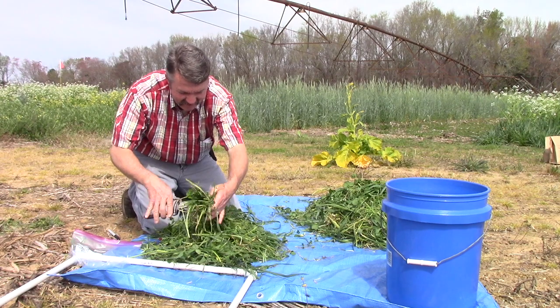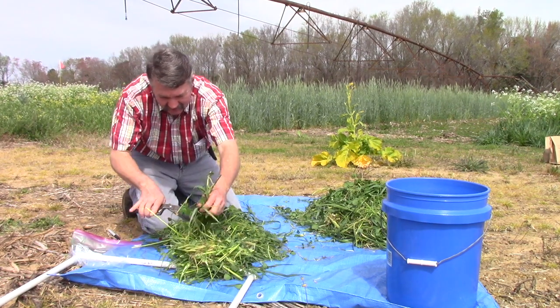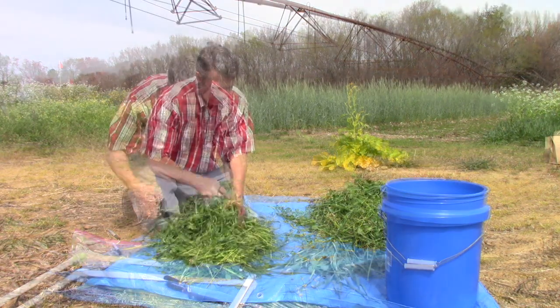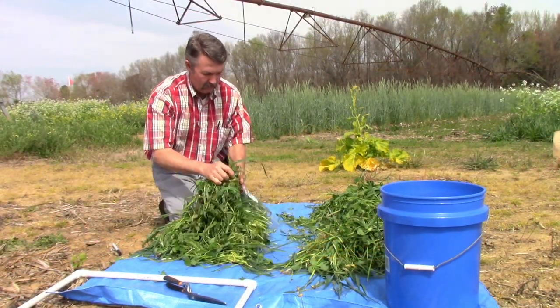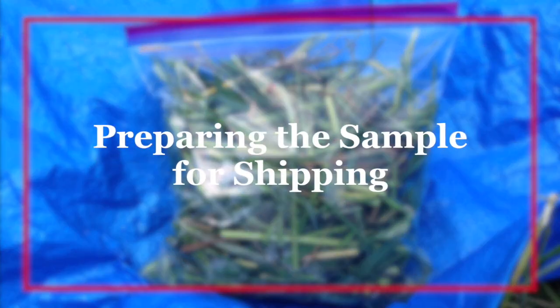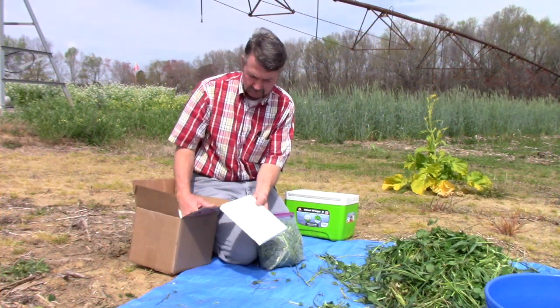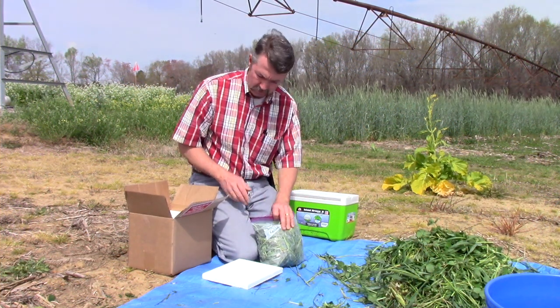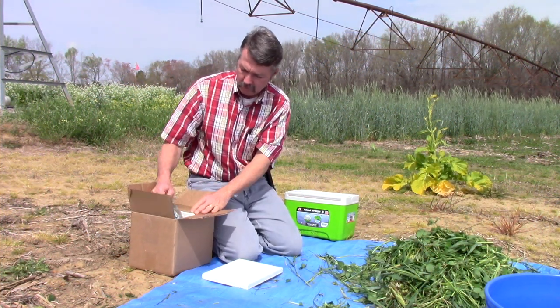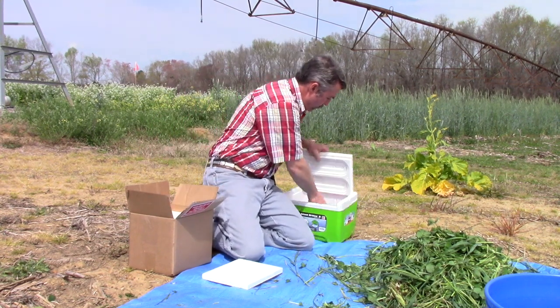In general, you should clip or chop to reduce the size of the sample. Clip, chop, or tear the material into pieces around 2 to 3 inches. Make sure the sample has dry ice or an ice pack in the package. Deliver to the lab the same day or send it overnight.